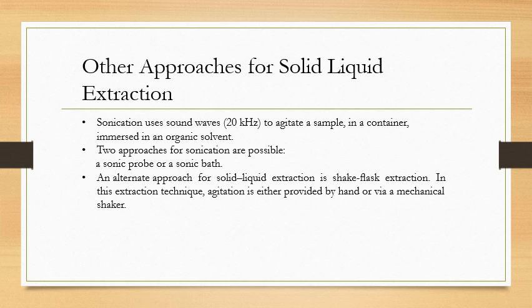The sample is then agitated by shaking for approximately 3 to 5 minutes. Then the extract-containing solvent is separated from the sample by centrifugation and/or filtration, and fresh solvent is added. The process is then repeated a further 2 times and all of the extract-containing solvent is combined. Multiple extractions can easily be carried out using the shake flask approach with the aid of mechanical laboratory shakers.